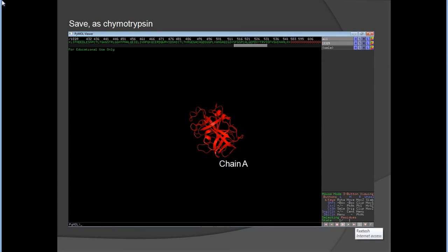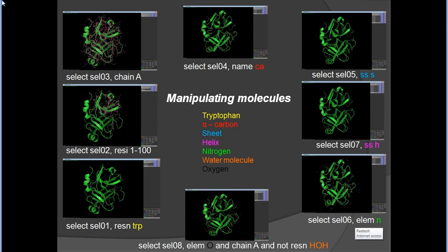You can name the selection as chymotrypsin chain A. For residue selection, type 'select sel01, resn trp' to select tryptophan, or 'select sel02, resi 1-100' to select residues 1 to 100. The same approach works for chain A alpha carbons and super secondary structures.